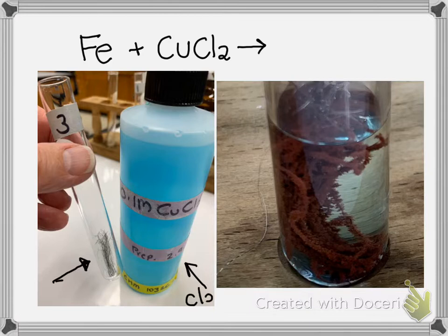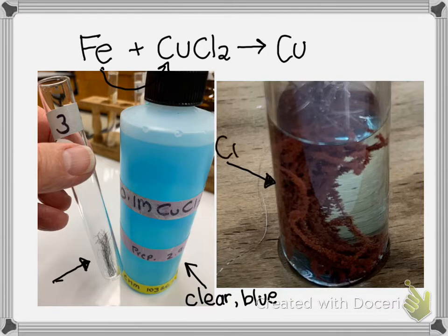It doesn't have anything in it, but it is a blue color. And so the iron replaces the copper. So the copper comes out, and do you see, this is really cool. That red on top of the iron is copper.